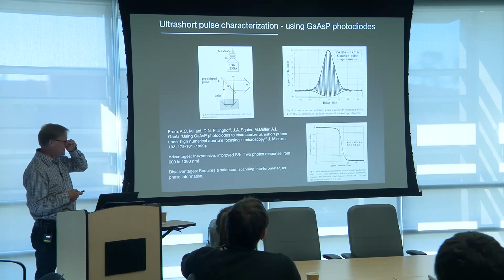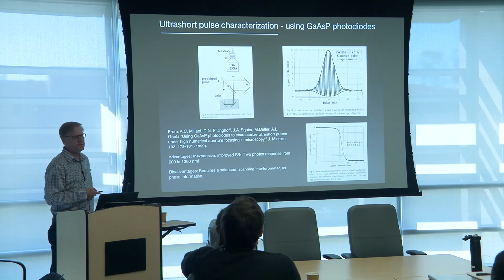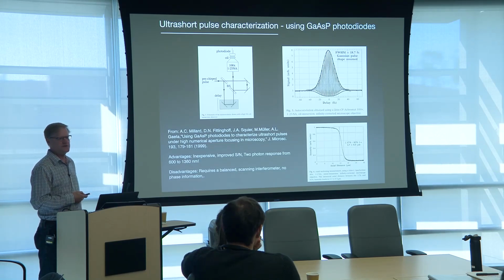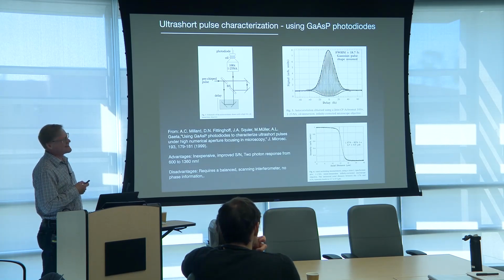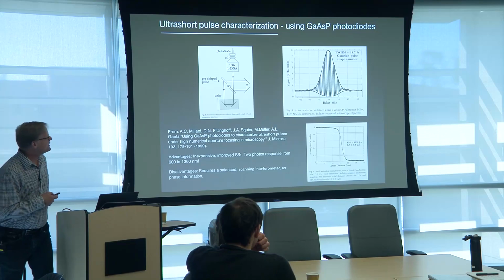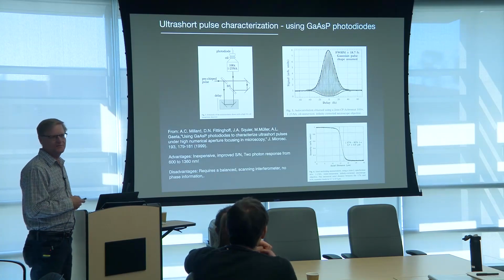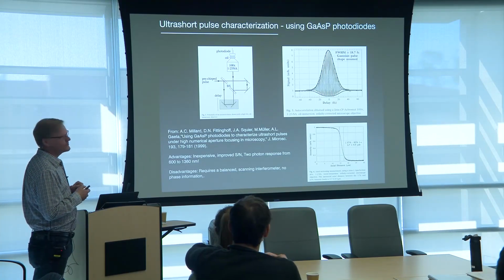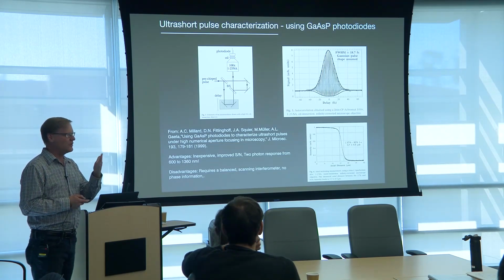And as we kind of progress, this is one of the other ways that I really like to do it, is to just use these gallium arsenide phosphide photodiodes from Hamamatsu and just look at the signal, how much the signal to noise improves with this guy. You can really do it just simply with room lights on. And we used to be able to, I think they actually have them. So when this first started, you'd have to write Hamamatsu and go through their impossibly complex purchase ordering system and say, could you please remove the window off of this diode? And they would. And so it cost about $100 to get this photodiode. Once they remove the window, then you can really use it with a small working distance objective.